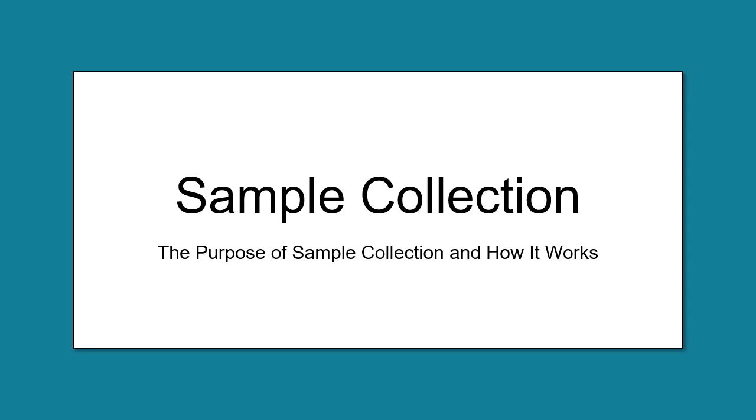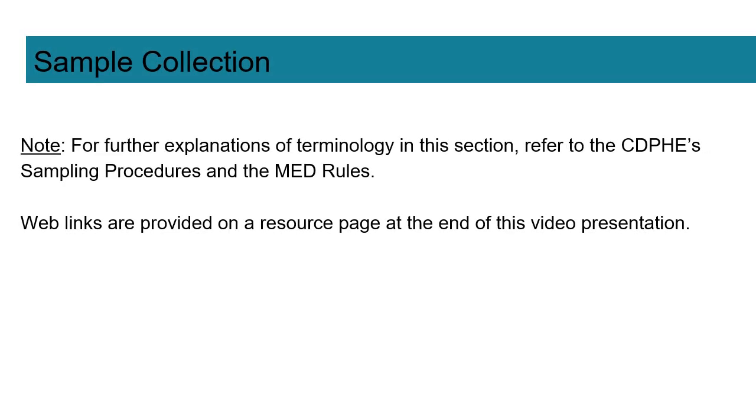Sample collection, the purpose of sample collection and how it works. For further explanations of terminology in this section that will be used, refer to the CDPHE sampling procedures and the MED rules. Web links are provided on a resource page at the end of this video presentation.